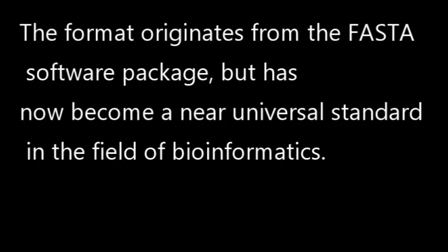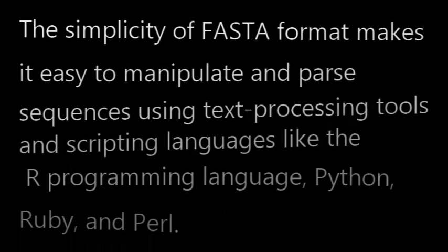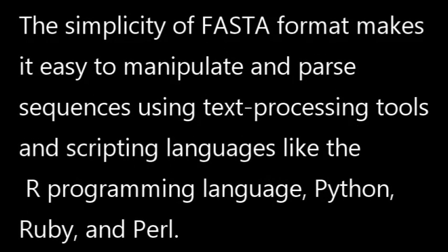The simplicity of FASTA format makes it easy to manipulate and parse sequences using text processing tools and scripting languages like R, Python, Ruby and Perl. So let's go to our screen to see how you can retrieve FASTA format using NCBI.